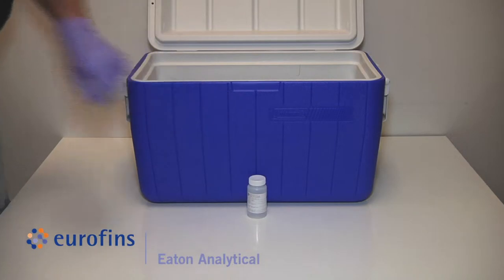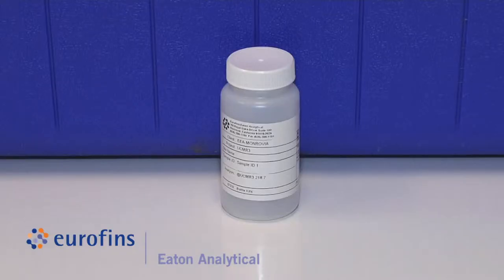Your 218.7 kit should include one empty sample bottle with preservative.